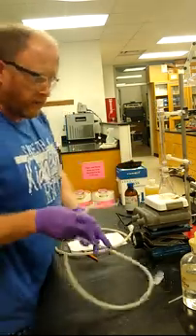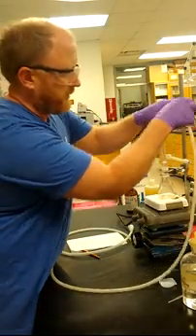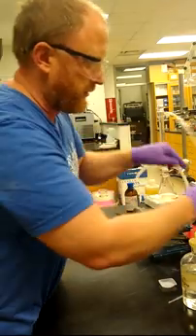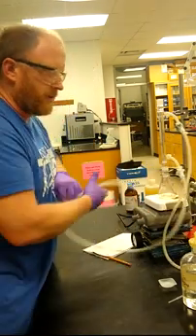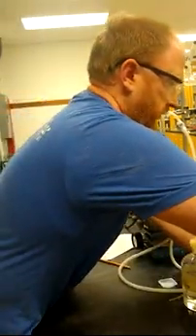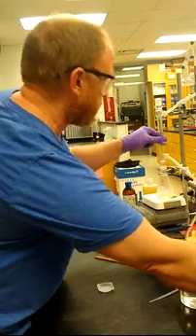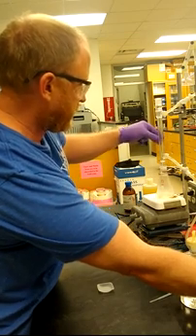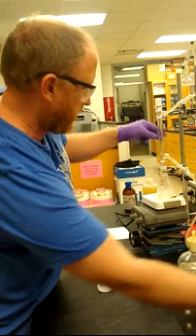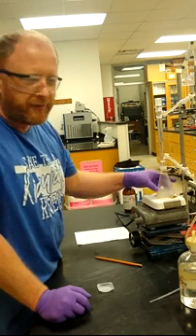You've done reflux before, so you remember how this goes. The water out is on top and just goes down to the drain. Water in is on the bottom, going to the faucet — snap it on. After you've got the reflux condenser hooked up correctly, you'll just want to turn on the faucet so you've got a steady water flow. Then you're just leaving the reaction stirring with low heat for about 15 minutes.